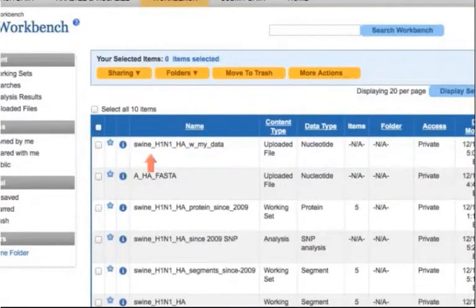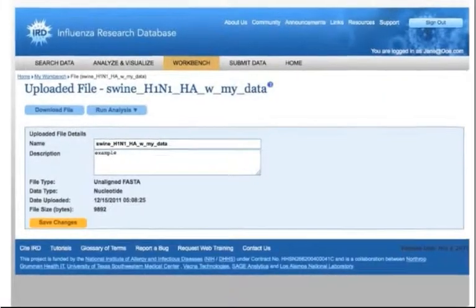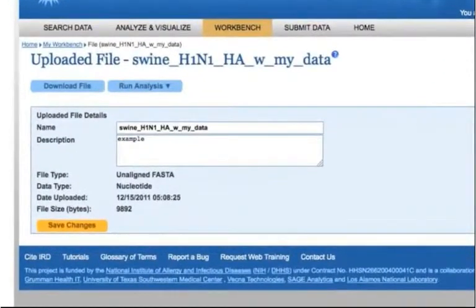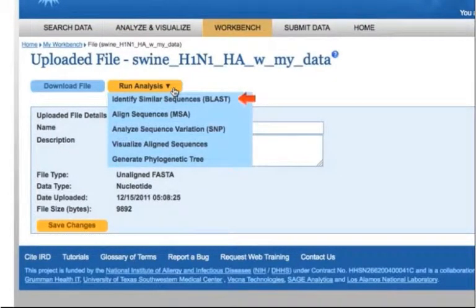The new working set will be visible from your workbench. Click the blue eye icon to load the working set page. Mouse over the Run Analysis button to see the available analysis options.